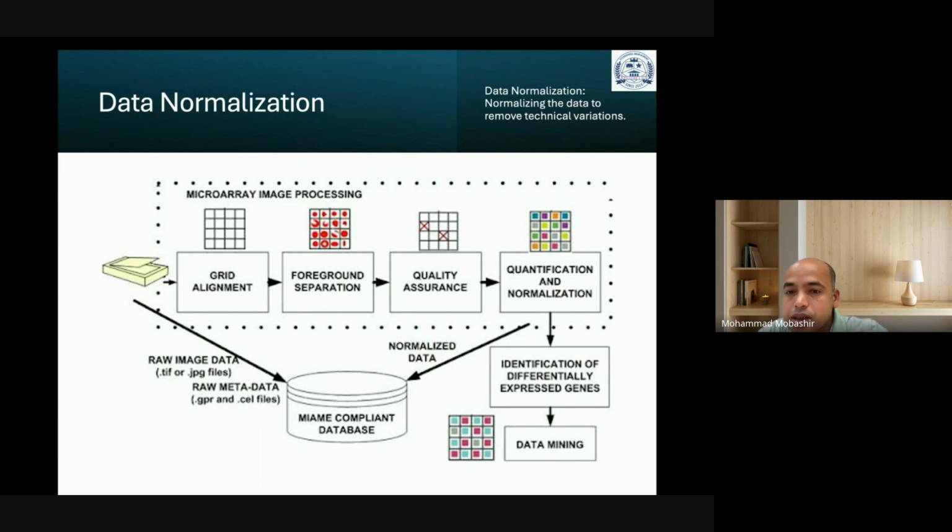It depends. For example, in human cancer, the fold changes are mostly quite high. If you want a strict parameter in order to consider only highly significant values, then you could also increase the fold change threshold, like plus or minus 3.0, or plus or minus 4.0, or plus or minus 5.0. It depends on how big the range of fold changes is.